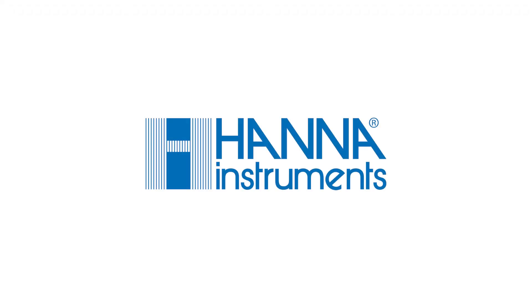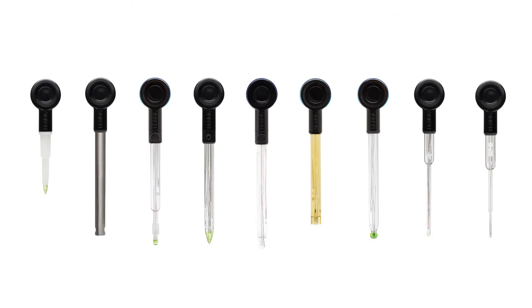The world's first wireless pH meter with built-in Bluetooth paired with a HANA Lab app. Designed for industry professionals and hobbyists, the Halo wireless pH meter line meets your needs.